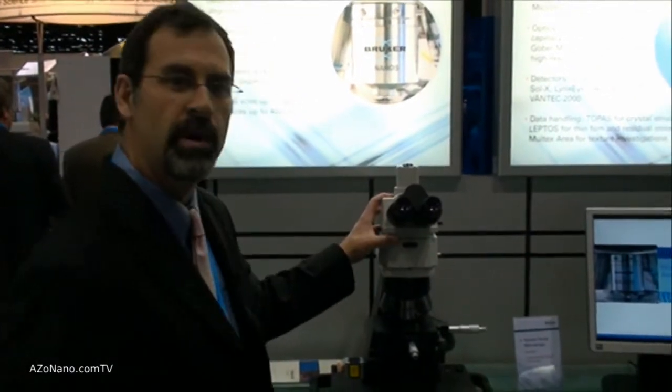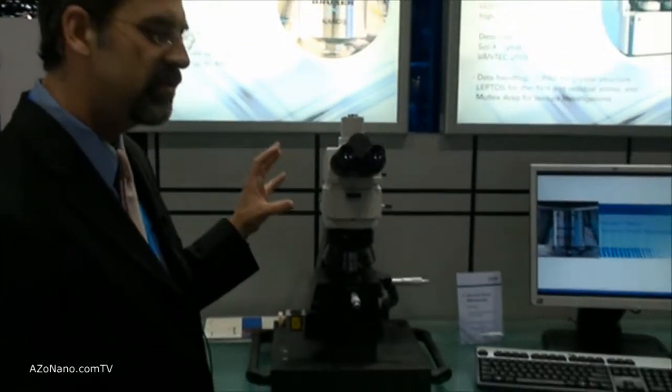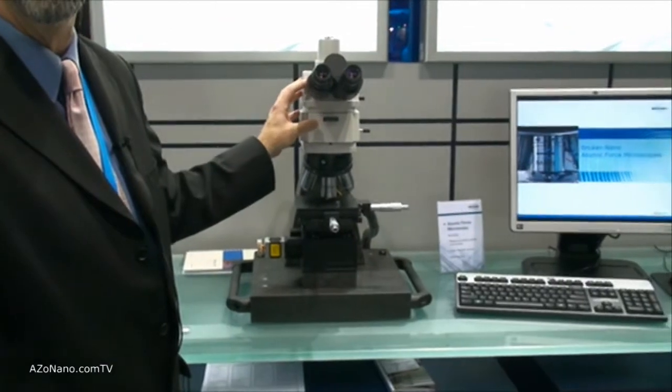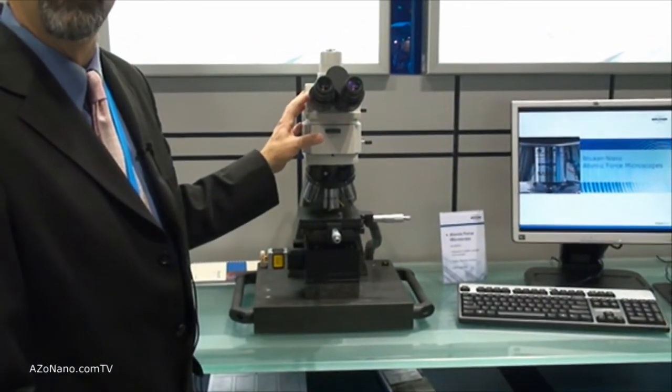So for your general purpose lab, your material scientist, this is ideal for finding that one little point of interest you're looking at, dropping your AFM on it, and off you're going.